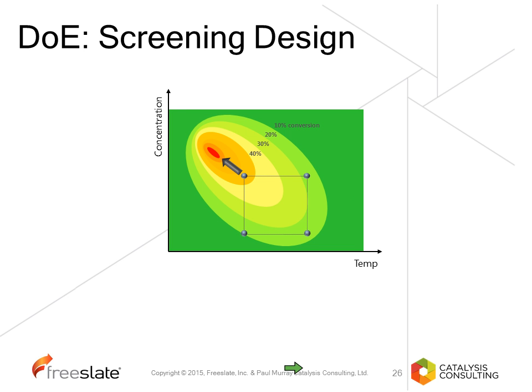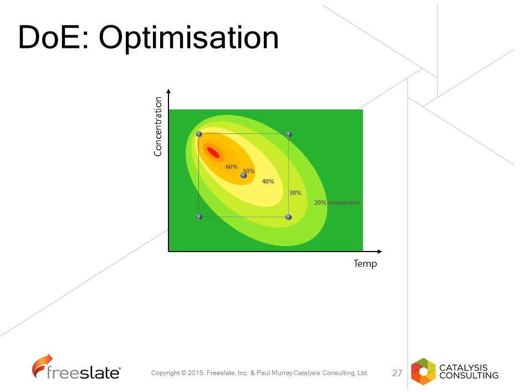So as we carry out the follow-up experiments, we base the new design on the maximum point that we have achieved so far. And from this, we gain more information. It is important to know that even though this point here for the experiment is not the maximum that we've had for the reaction, the experimental design will actually predict results around this.